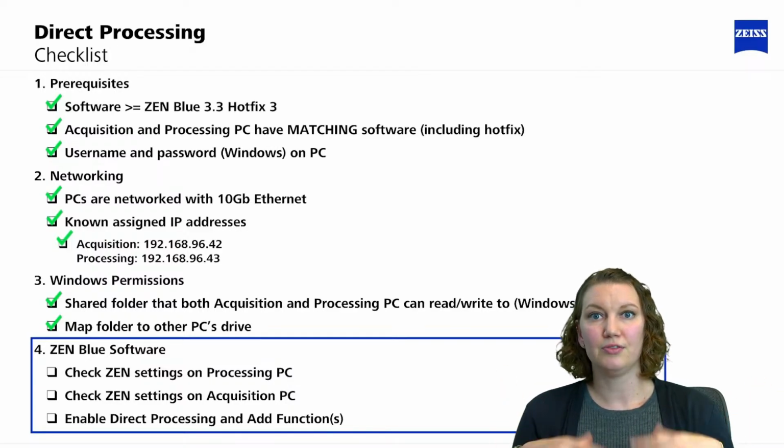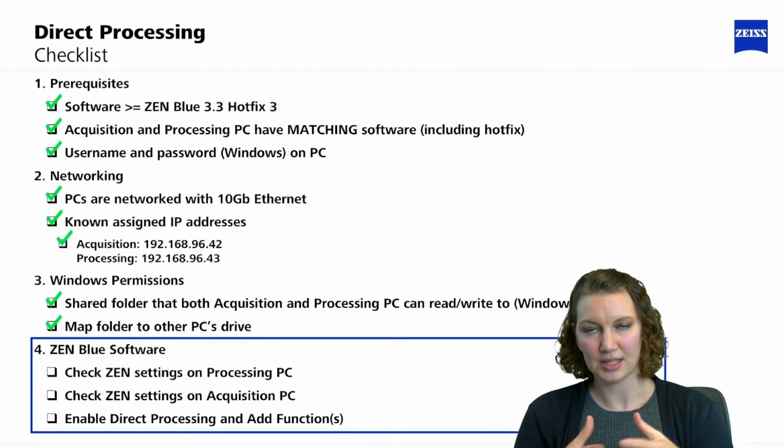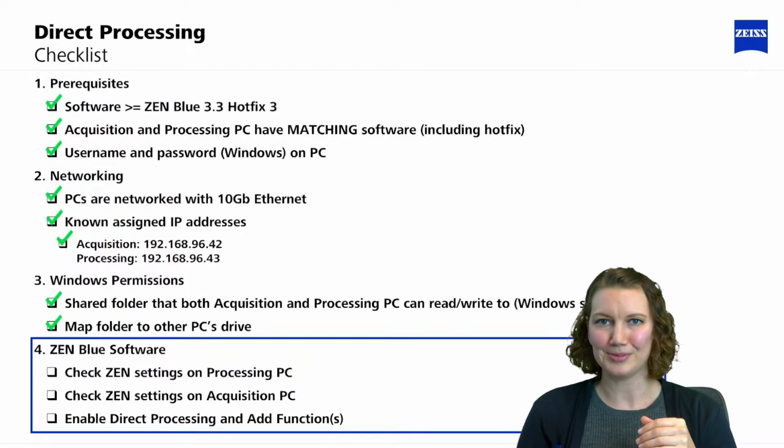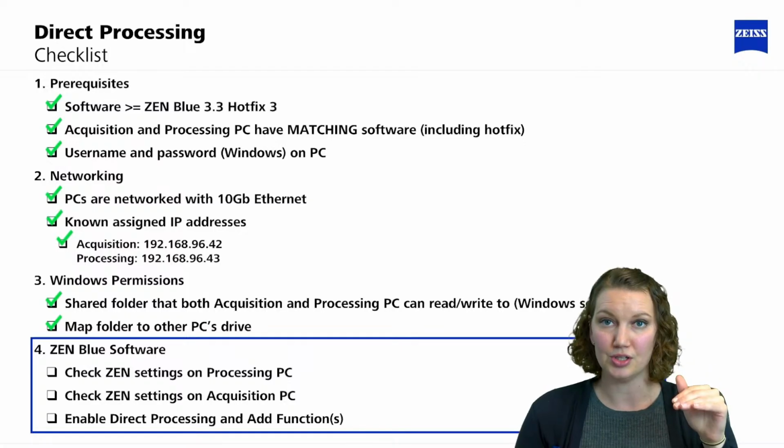And then, of course, typically if you do have this as part of your package, we set it up at the beginning, so you don't typically have to worry about all of this networking and Windows permissions, but occasionally software updates on the Windows side are known to mess up some things, so it's just useful to know this is how the basic setup goes.